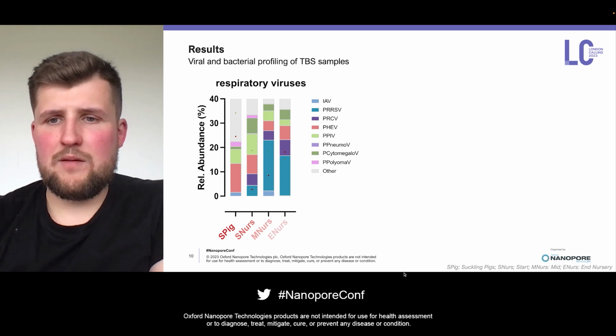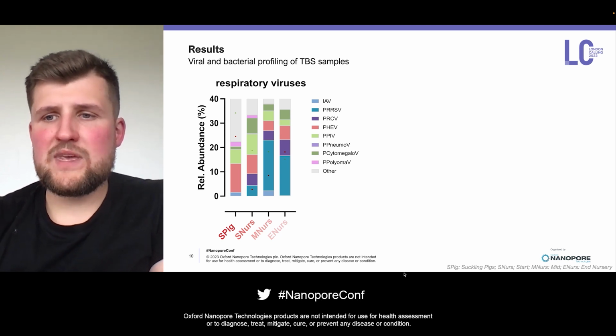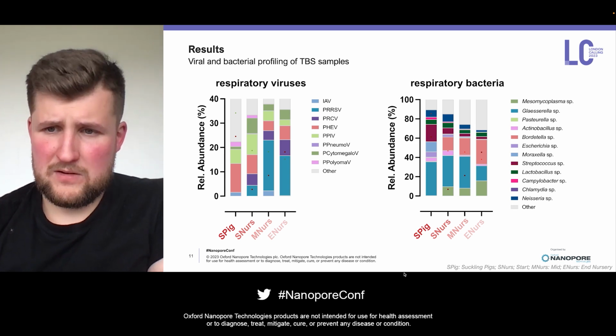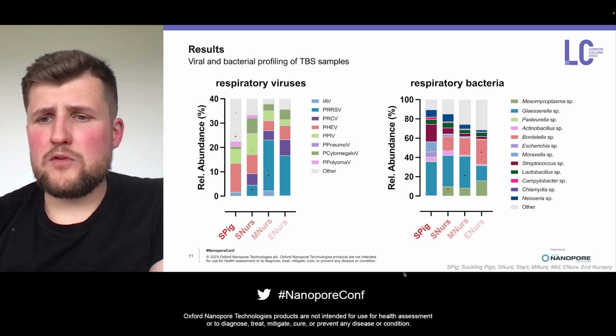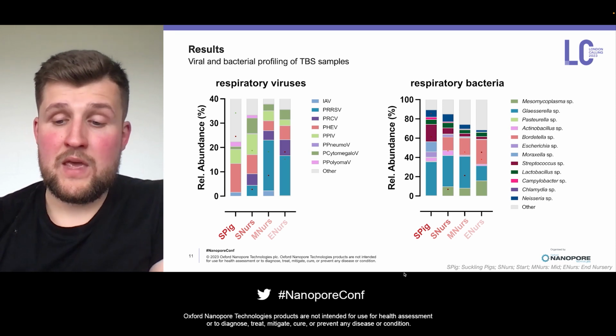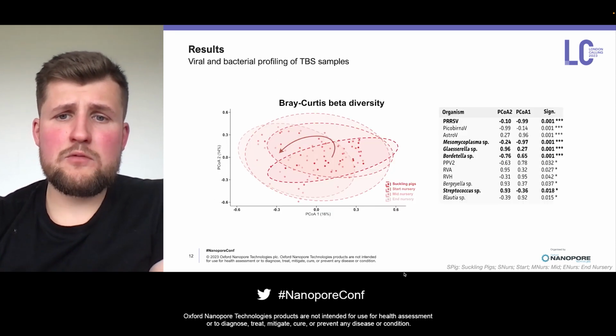Now, we can do the same for the bacteria, in which we can see a clear reduction of Glaesserella and Streptococcus over time. We also see that two bacteria, Bordetella and Mycoplasma, only appear after the suckling period. Now, what can be done further with this data?